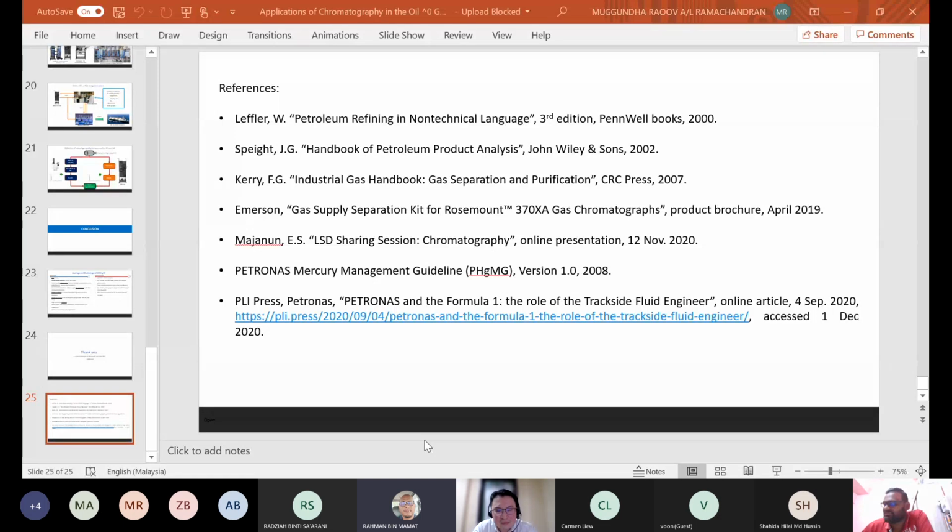I got one. Like you are dealing with the hydrocarbon samples. It seems there are lots of impurities, right? That means through a day you run a lot of samples, so there is going to be more downtime, right? How do you handle it?